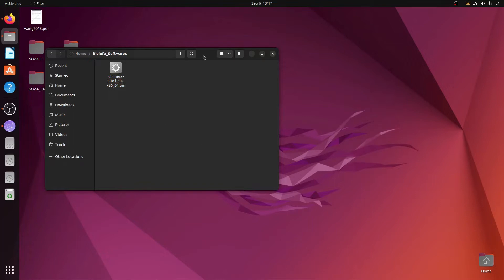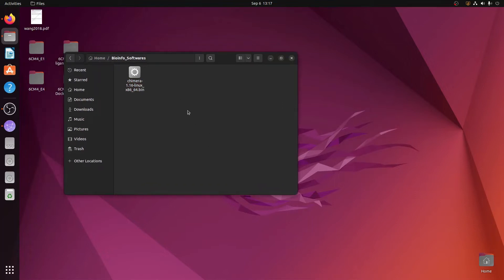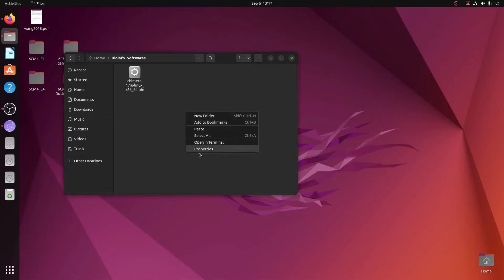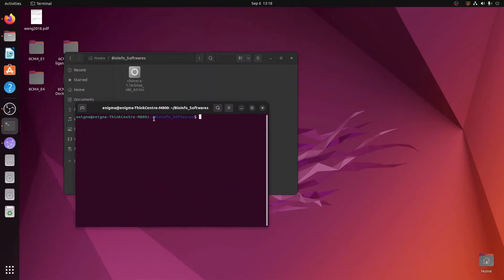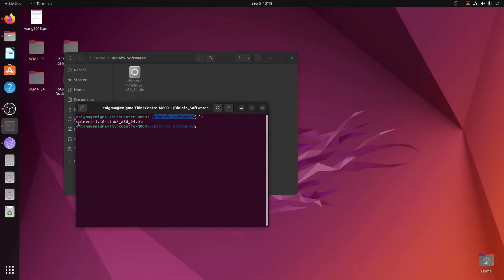Within this folder, simply do a right-click with the mouse button. From the options that appear, go to the second-to-last option which says 'Open in Terminal' and click it. Your Linux terminal will open inside the bio info software directory — the same name appears in the terminal as well. Simply press ls to see the file located in this directory.